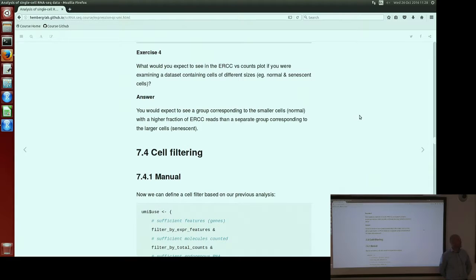So I've recently seen data using 1 to 2.5 million and 1 to 5 million dilution ratio of ERCC RNA to endogenous RNA, and that gives typically less than 1% of the reads per cell going to ERCCs. So that is useful for QC, but definitely not enough to do any normalization based on those ERCCs. You would obviously need to increase that ratio a lot from that point, so 1 to 2.5 million, to get anywhere close to 50% or whatever percent of your reads going to the ERCCs.